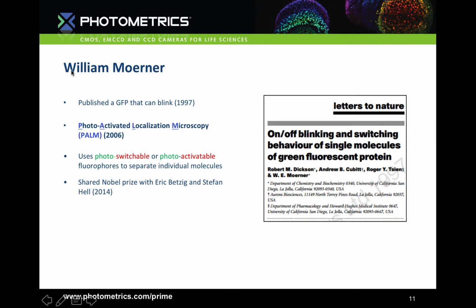William Moerner provided the next piece of the puzzle when he worked out how to make proteins blink or switch, and in 1997 he published a blinking GFP. So the idea was that we could suddenly do exactly what Betzig proposed. So Betzig came back into the fold and using the photoactivatable GFP showed what we call PALM, photoactivated localization microscopy.